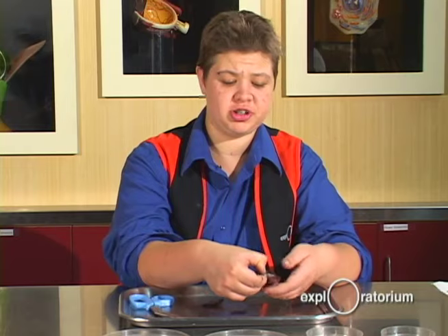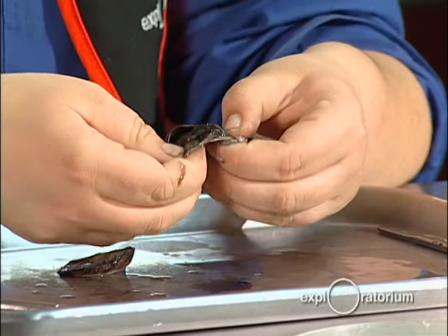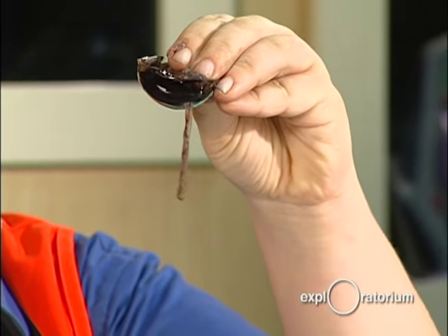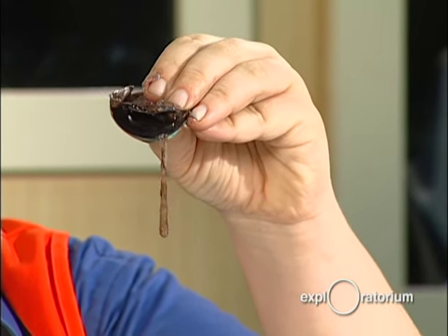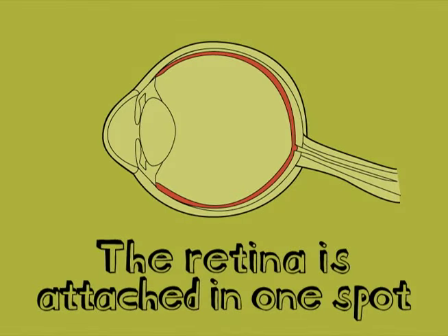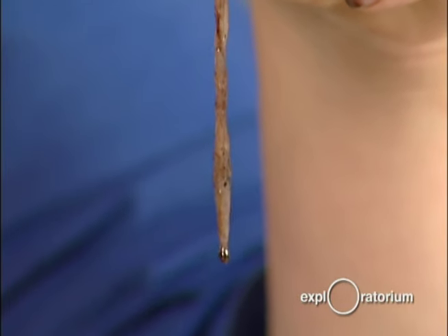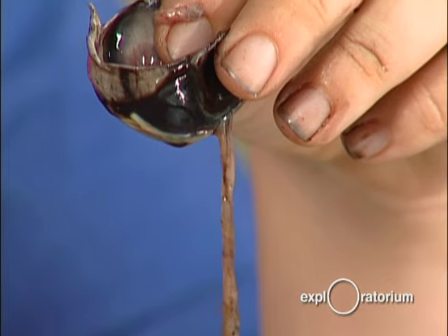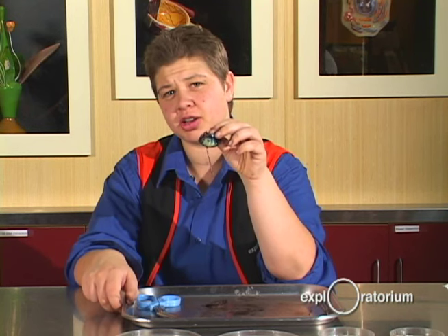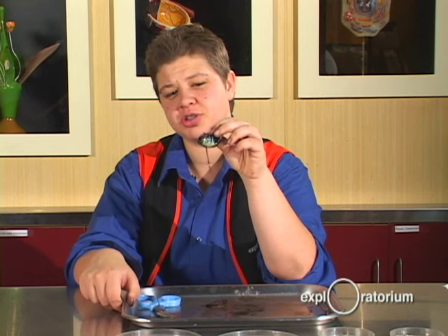Now we're going to look at the retina. I'm going to remove the vitreous humor and put it in this tray. The retina lays flat in the back of the eye and is all connected at one point — that thing hanging right there is the retina. The retina detects light: it has cone cells, which allow us to see color, and rod cells, which detect whether or not there is light. The point where the retina hangs from is considered your blind spot, where light can't stimulate that one point. Normally the retina lies flat because the vitreous humor pushes it against the eye; if the retina gets folded or wrinkled, it'll distort the images your brain is interpreting.